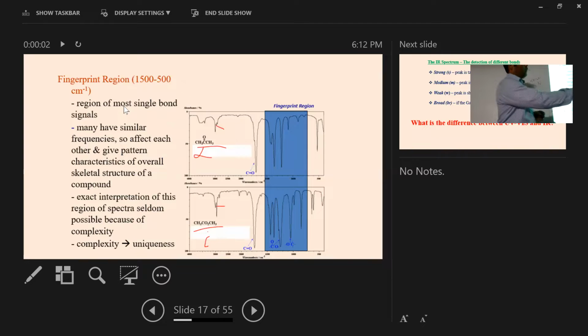So if it does not absorb at all, we will have close to 100%. As we have previously shown, someone mentioned that the line is not flat. So from experiment, we are getting it like this. Actually, we expect that here no IR light is absorbed, but still we can have some absorbance, because here we do not have any vibration.